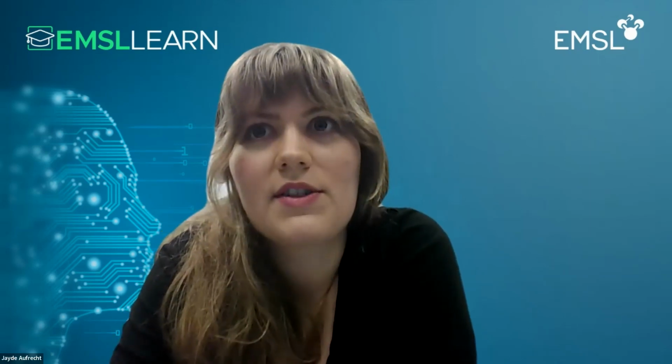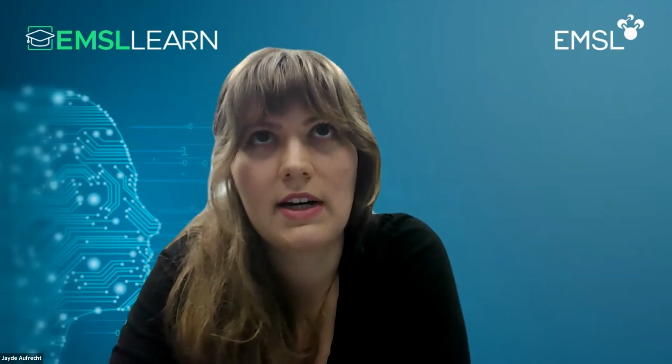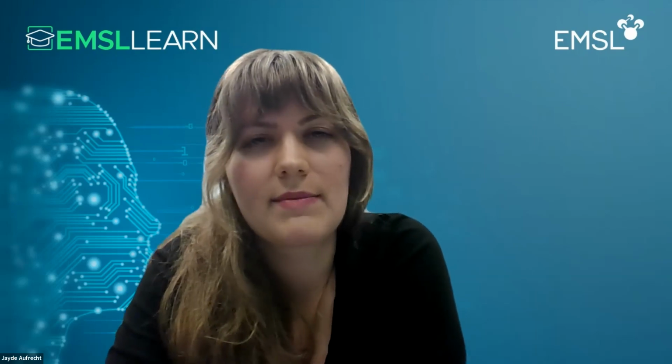Great. Andy Plymail has a question. In the synthetic soil aggregates, can the water saturation be varied? Thanks, Andy. So it is a hydrogel, so it has to be hydrated with water. We can change the degree of methacrylation and the amount of gelatin methacrylate to water ratio, if you're interested in changing the amount of water in there. But it is mostly a saturated system.